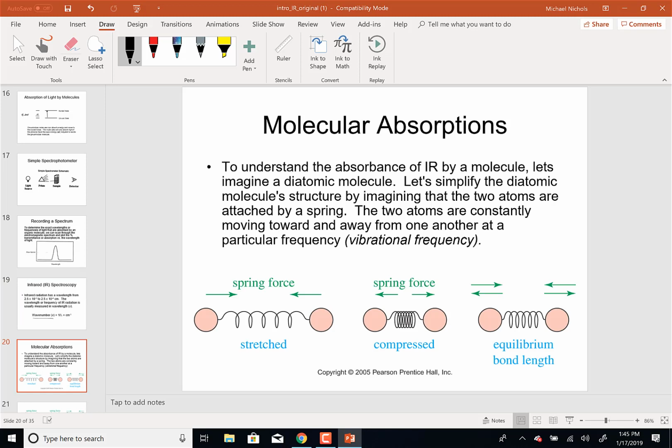So how do molecules absorb infrared radiation? I have some sort of videos of this on a thumb drive sitting on my office desktop, so I will, at the first break, go and get them. But the way infrared radiation works is that the wavelength of the light is exactly the same as what are called molecular vibrations. So here we see springs, and that's the way molecules are typically represented when we talk about infrareds.